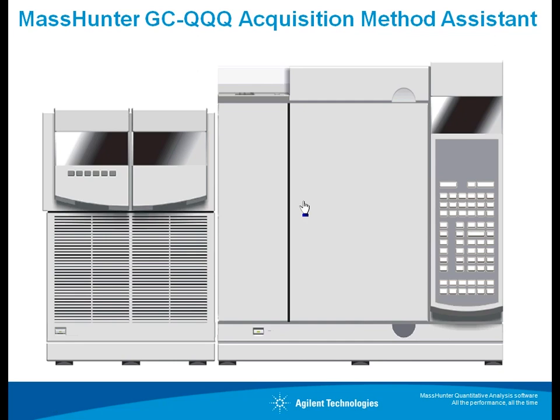We're talking about a GC triple here, as the picture shows. The steps for the optimization assistant are the same with an LC triple as they are with a GC triple. One small difference is that with an LC triple we're trying to optimize both the fragmenter and collision energy, where in the GC triple it's often just focused on the collision energy. So if you follow along with the steps, you should be able to create the set of experiments which end up showing you the optimum conditions.